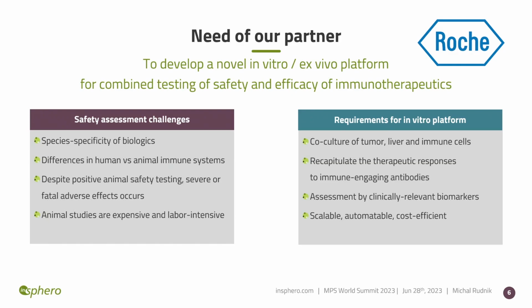of biologics. Currently, the drug safety field relies on animal models, even though biologics are species-specific, and we know about the differences between the human and animal immune systems. And even if a new drug passes the safety assessment, severe or even fatal adverse effects still occur in clinical trials. On top of that, animal studies are expensive, labor-intensive, not even mentioning the ethical considerations.